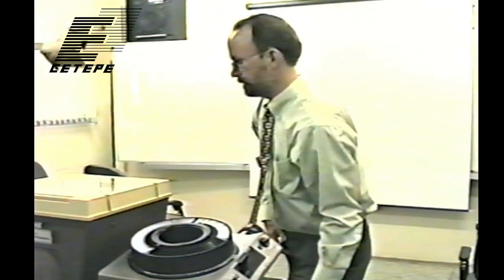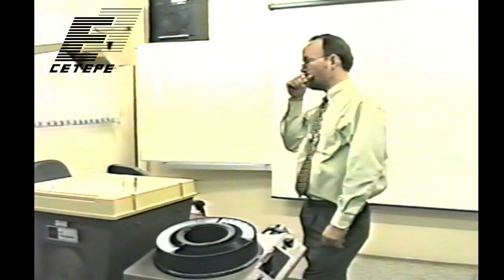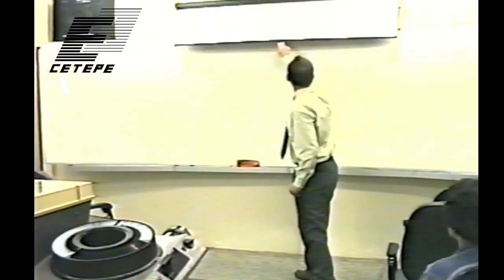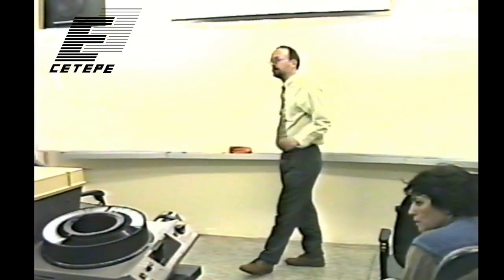Yes? Have you ever heard about the back-illuminated CCD? Some people say that the back-illuminated CCD is better than the forward. It is. It is. This is a detail that I didn't get into. I don't know if my picture is still up here, but no. As better as much expensive is.